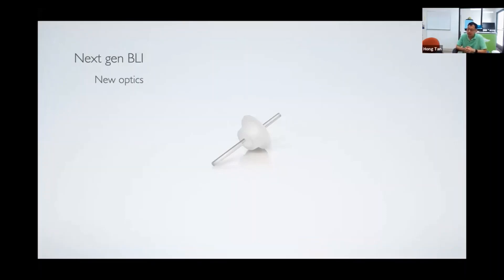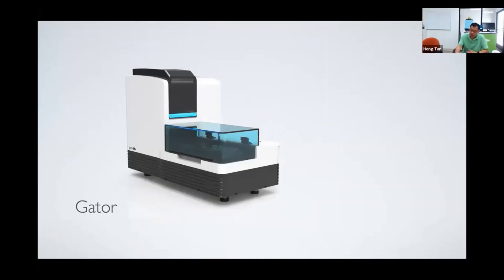We designed new optics and new chemistry that gives us much better performance than the previous generation BLI. This first Gator instrument uses standard 96 well plates and has eight channels. We can read eight assays simultaneously in parallel. It can read data at 10 Hertz, fast enough to measure small molecule reactions or fast on, fast off activities.